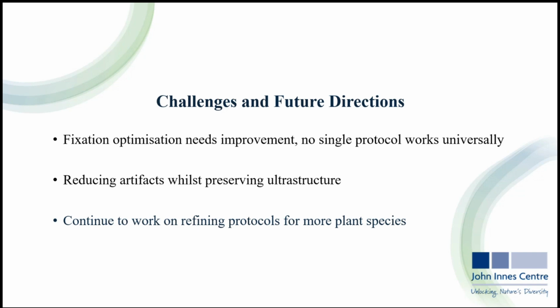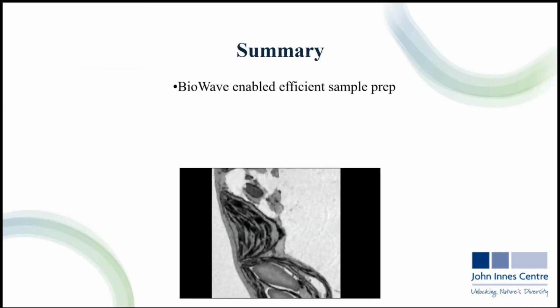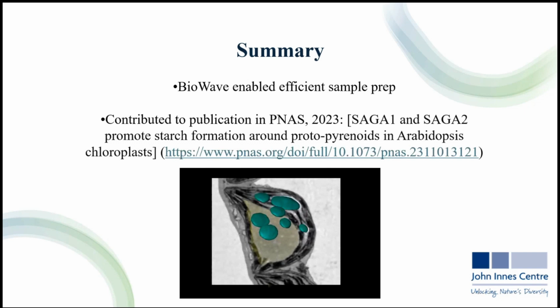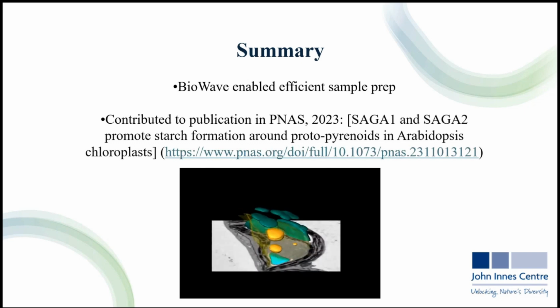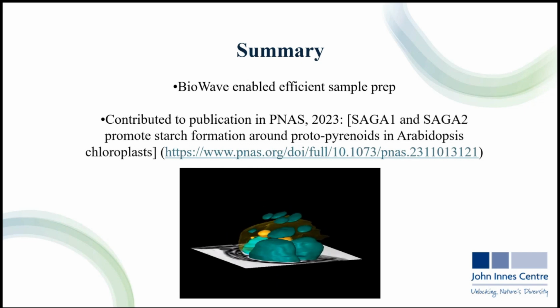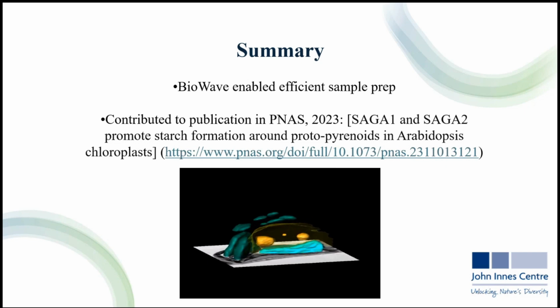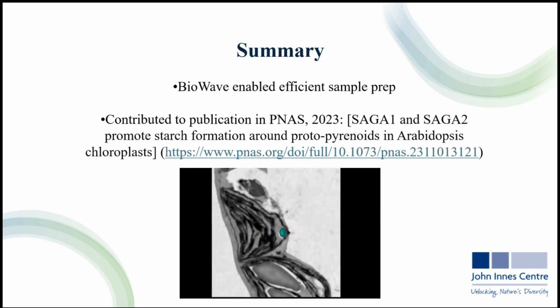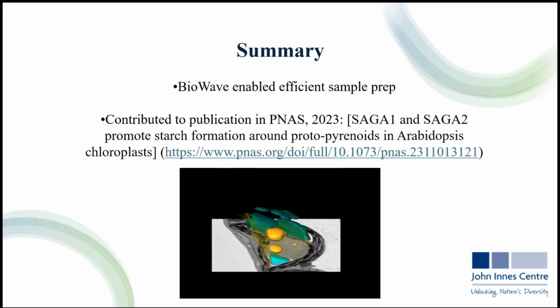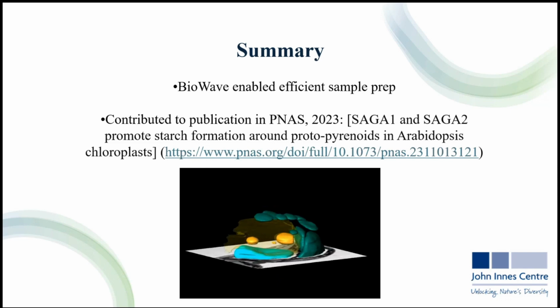So to sum up, here are some of the key takeaways of the study. The BioWave enabled efficient sample preparation, and it will continue to do so for future projects and for protocol development. Finally, I'd like to mention this piece of work that contributed to a recent publication in PNAS, where an Arabidopsis plant was engineered to develop a protopyrenoid to improve CO2 capture efficiency. While the BioWave wasn't the primary focus of the paper, it did play a really important role by allowing us to prepare plant tissue samples more efficiently, which enabled us to achieve high quality results in a shorter time frame.